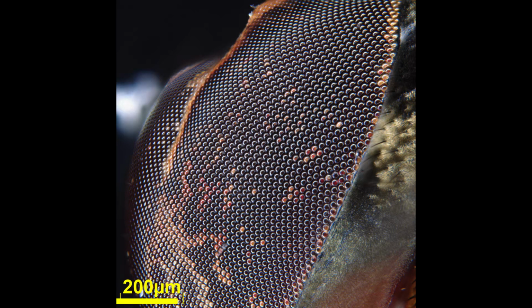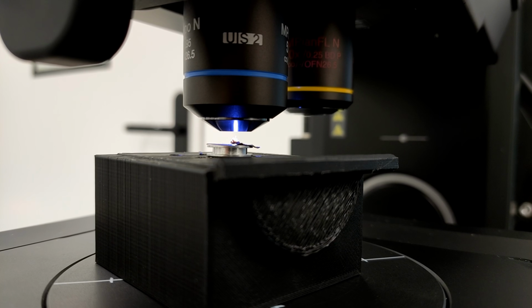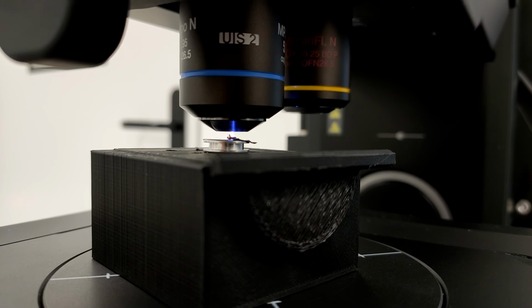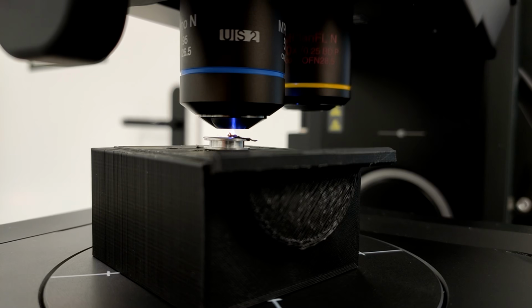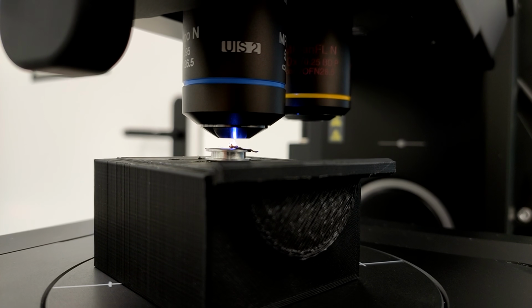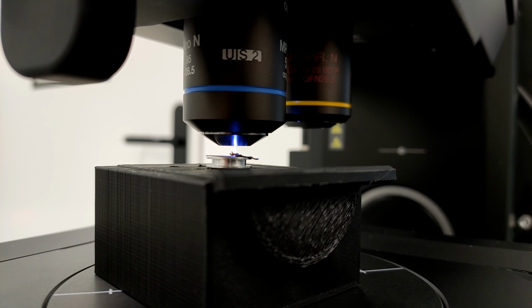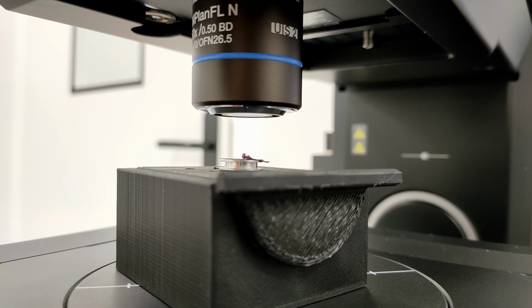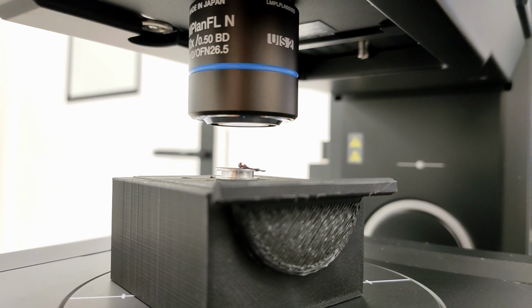In general, higher magnification means shorter working distance and shallower depth of field. There are special microscope objectives that provide a longer working distance, for example 1 cm instead of 0.5 mm, at the cost of slightly reduced resolution.